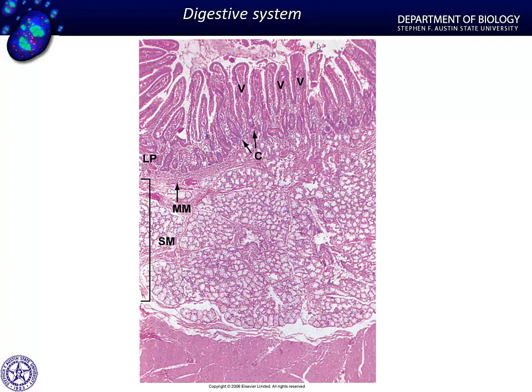So here we have a section of intestine. We can recognize this because we've got our intestinal villi. You see quite a bit of space between each one of these. And in most of these, we're going to see an open space in the very middle. That's going to be our central lacteal. Then at the base, where you see that we have a coming together of this material, here, this is going to be our crypts of Lieberkühn in this area.